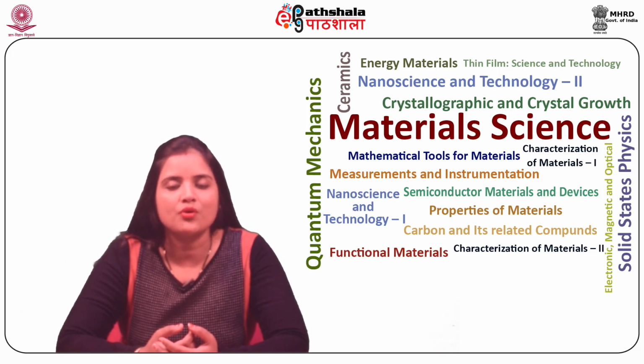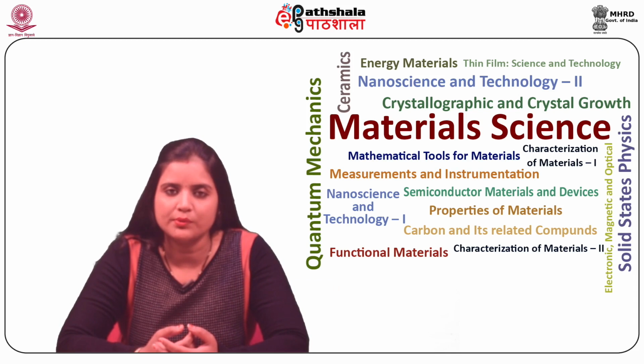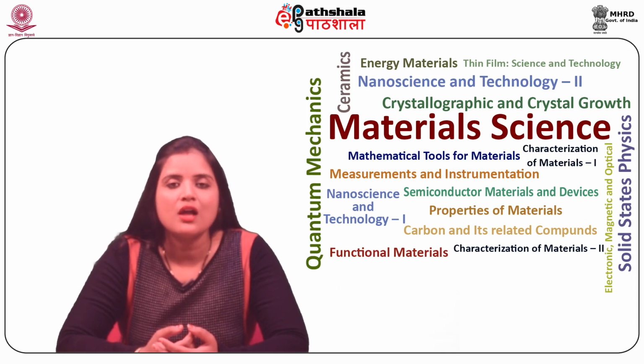Today we are going to discuss the module Scanning Near Field Optical Microscopy from the paper Characterization of Materials 1.